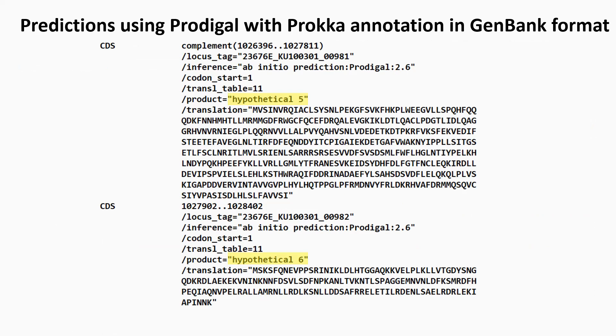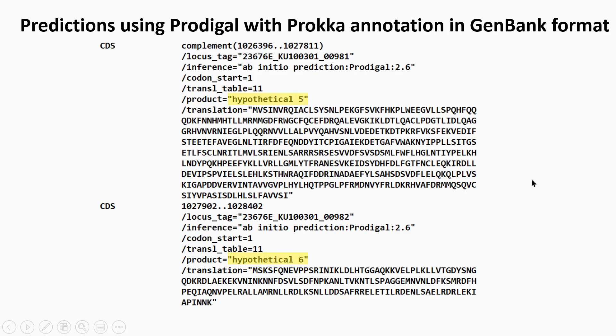And although the gene sequences aren't actually shown here, these products are from identically predicted genes as to RAST. So RAST and Prodigal have both predicted hypothetical five with a TTG start codon.